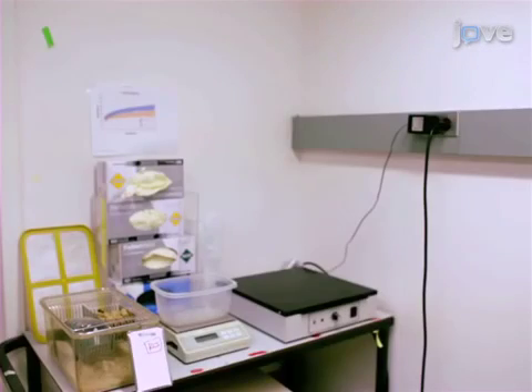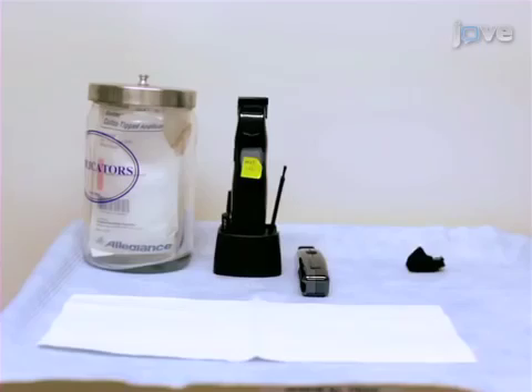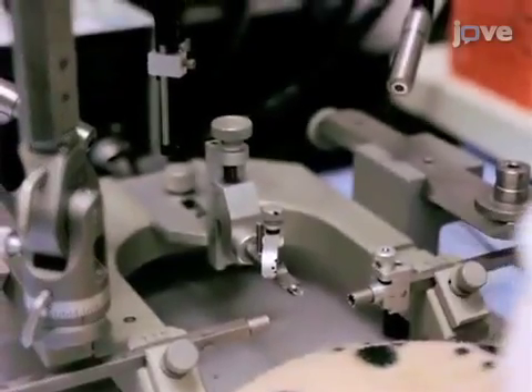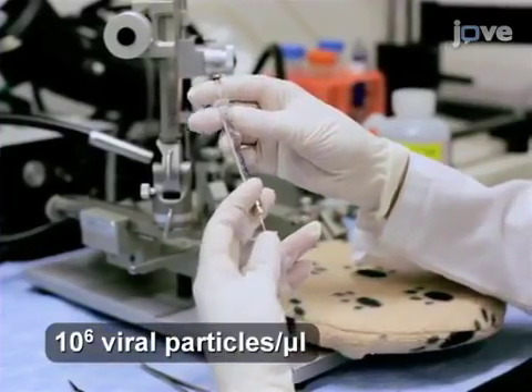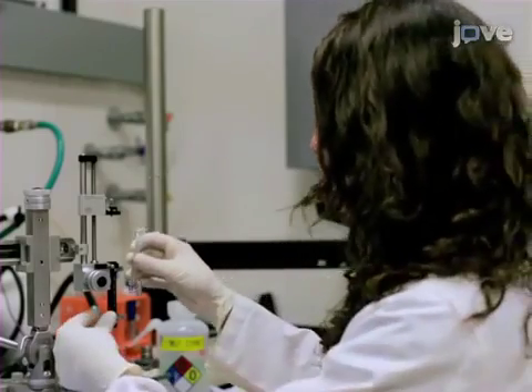To begin, place a mouse cage with bedding on a heat block to warm for post-operative recovery. Set up an electric razor for shaving the head, and ethanol and iodine to sterilize the scalp. Using a 5 microliter Hamilton syringe, draw up 5 microliters of viral vector and set it up in a syringe holder on the stereotax.